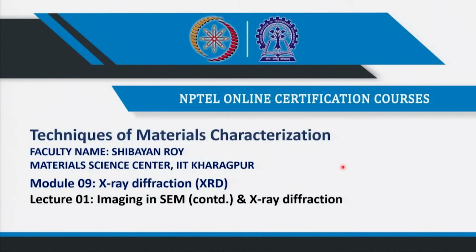Welcome everyone to this NPTEL online certification course on techniques of materials characterization. We are now in module 9, it is week 9, we have 4 more weeks to go, and this week and onwards we will be discussing X-ray diffraction. We have previously finished various other imaging, mostly microscopy techniques. So, we started with some general concepts of microscopy, and then we discussed optical microscopy.